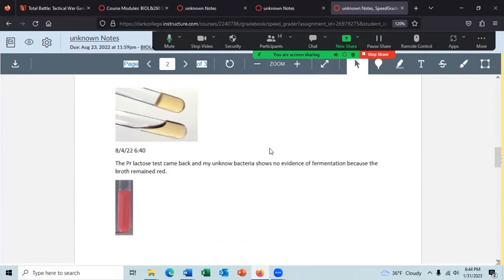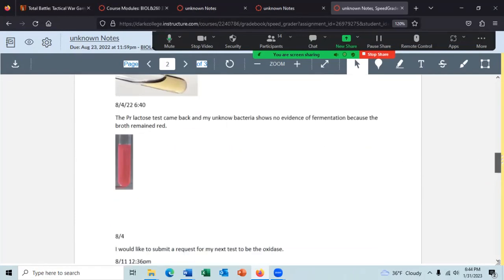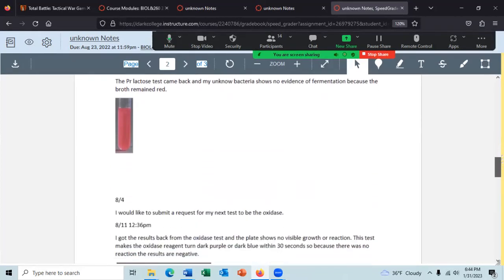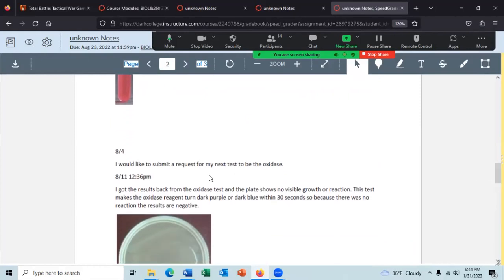And there's the results of the gelatin hydrolysis test, and there's the results for the PR lactose test. And he's got it right here. No evidence of fermentation because the broth remained red. And then he wrote up on 8/4, which I guess is the same day. He wanted to do the test on oxidase.